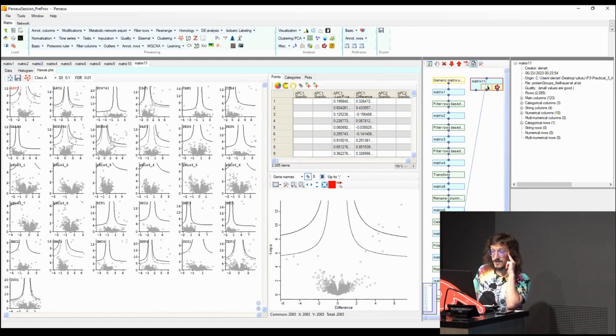So yes, we have our bait protein with then all the possible complexes that it forms against the unspecific binders. They are all here, and here there are the possible proteins with positive log-fold change, so it means the proteins that may have formed a complex with the bait.